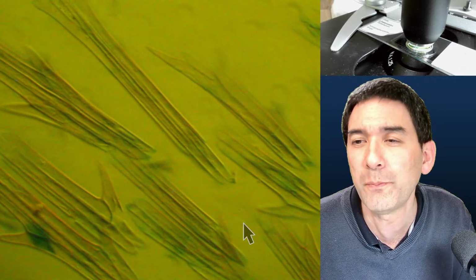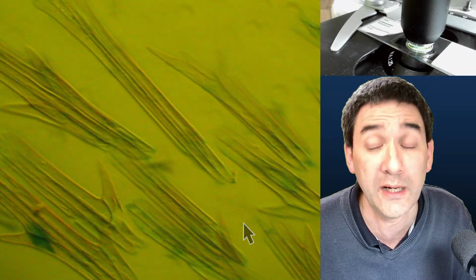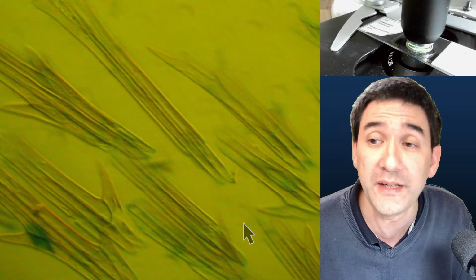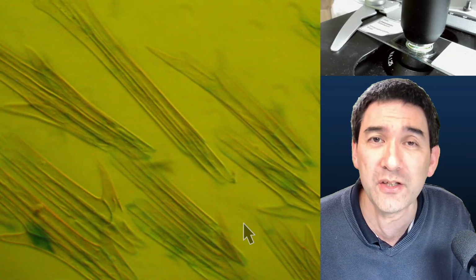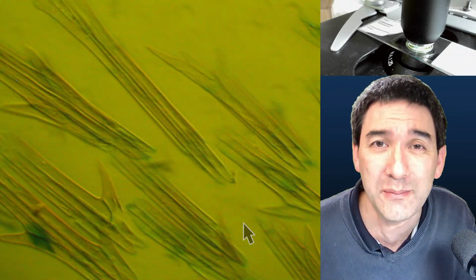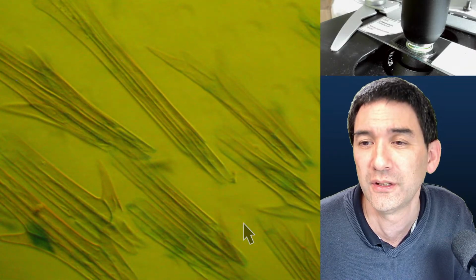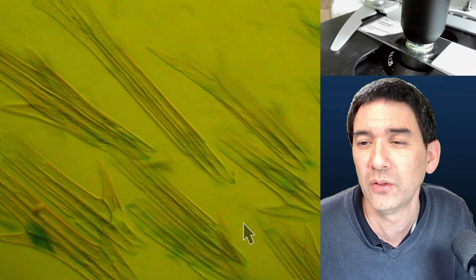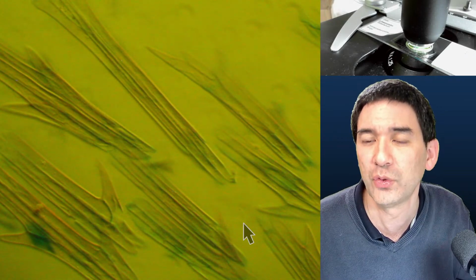Laser printers use opaque toner. Wouldn't an inkjet printer on acetate film be better? I tried it out, and what I found is that both inkjet and laser printers sometimes did not give a sufficiently colorful or dark image, so I had to stack them on top of each other. Yeah, so there is some communication going on here as well.